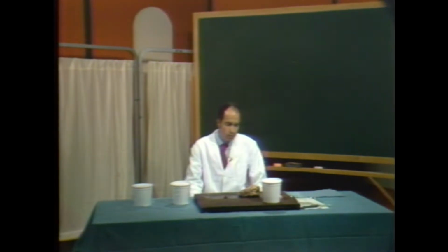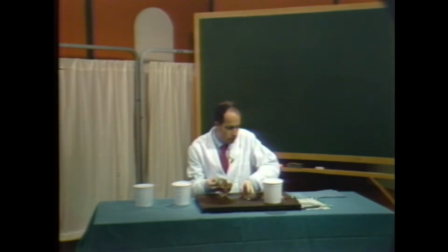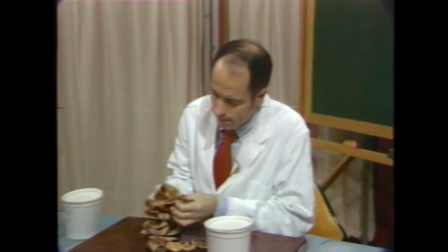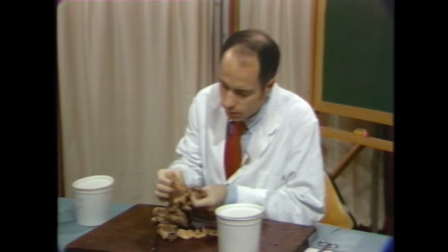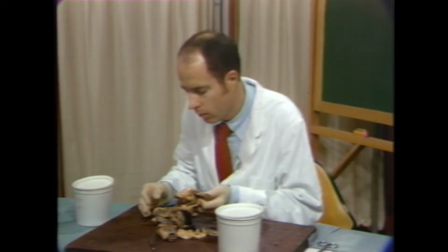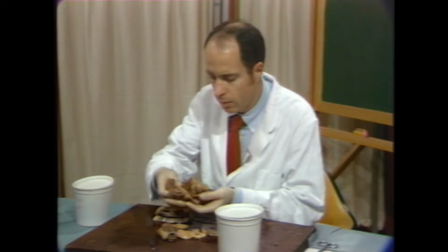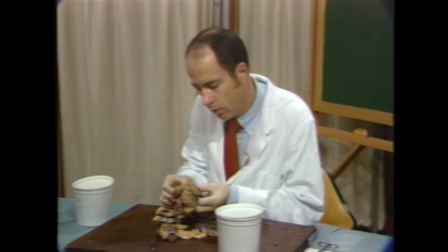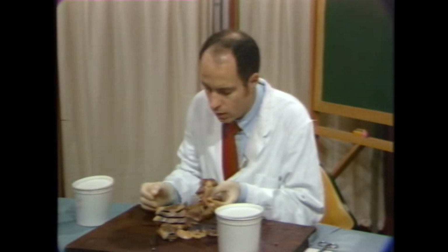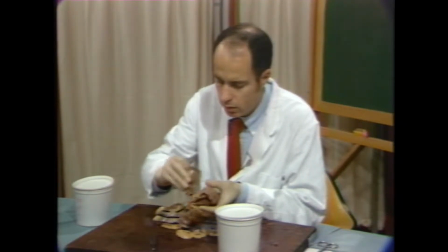The first specimen here has been opened already, obviously. There's many ways to open hearts. It's always personal, no two people open hearts the same way. No two people examine a patient exactly the same way either, I guess. No two people operate precisely the same way. I'm sure that if I opened this heart initially, I would have opened it differently.